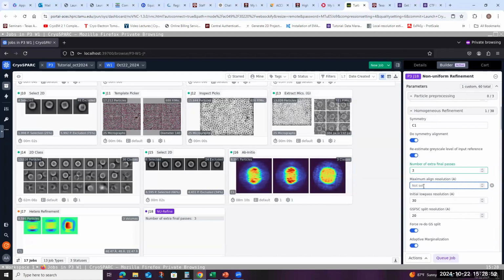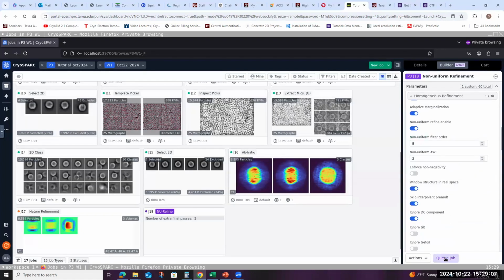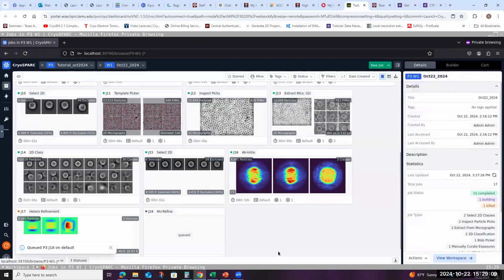You might want to run more iterations, let's say after it has converged, you still want to run a few more iterations to make sure it converged very well. So you can run it, and you will see here the iteration.